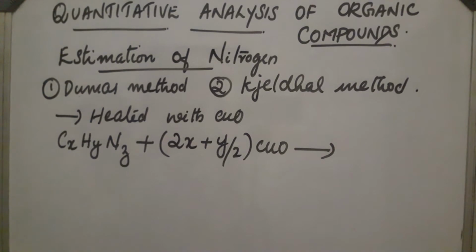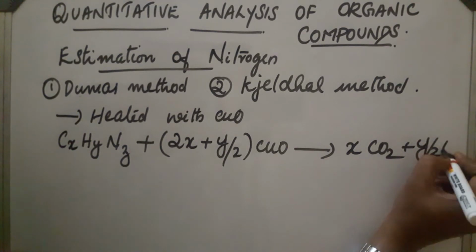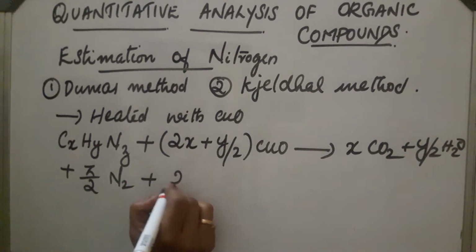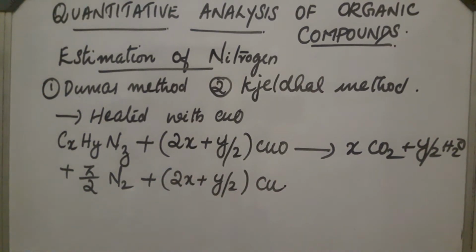Along with that, nitrogen is also produced. xCO2 + y/2 H2O + z/2 N2 + (2x + y/2) Cu. Like this, the reaction is taking place.